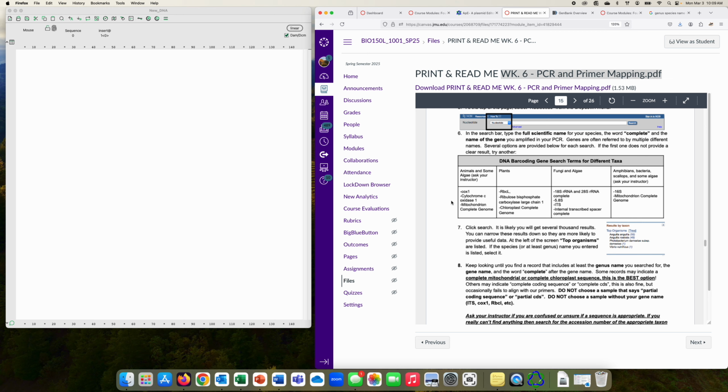the target region of the area that you're amplifying in the species that you think you're going to detect. So in this case, I'm looking at a vertebrate animal. I'm hoping to find beef or Bos taurus or a cow. And the primers that I'm using to detect a vertebrate animal are these primer sets in this column here. So I'm using the mitochondrial COX-1 DNA, or that region of the cow genome or any vertebrate genome. That's the region that I'm amplifying.